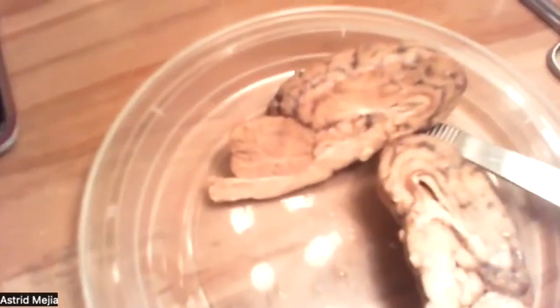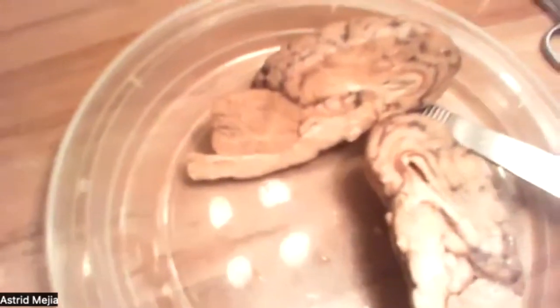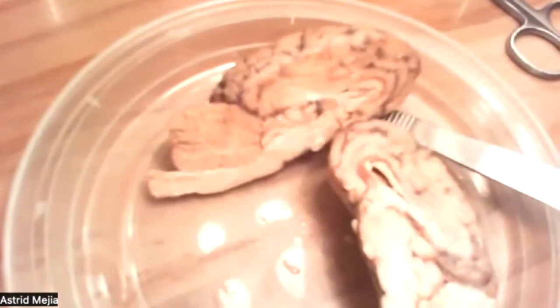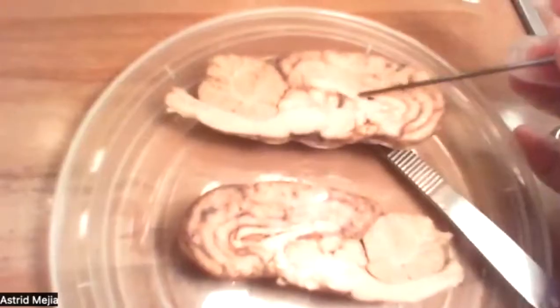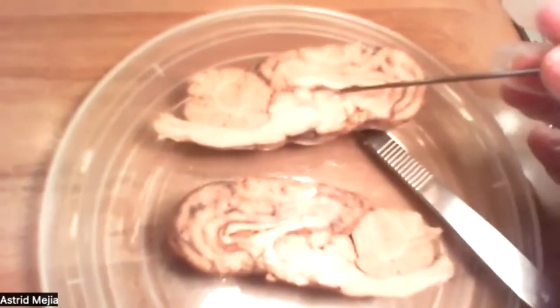So for this part, it's going to be the sagittal view. And basically here you're going to be able to see the third ventricle. It would be basically right here.